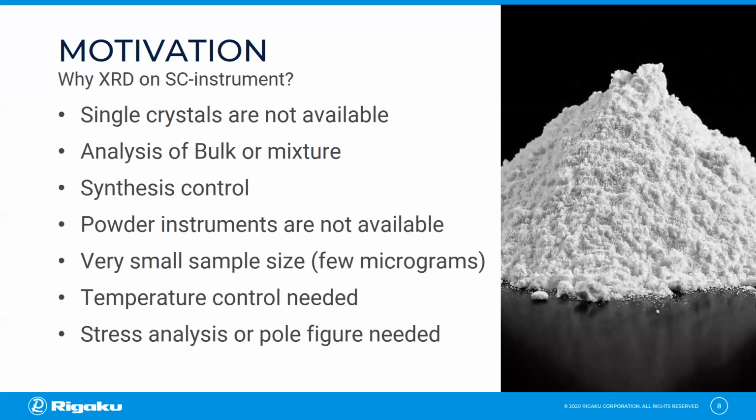Why and when should you use your single crystal diffractometer for powder diffraction? Sometimes single crystals are simply not available from your synthesis, or you already know the structure and want to control your synthesis outcome without performing a sometimes time-consuming crystallization. Under these circumstances, you want to perform a powder diffraction experiment. Powder diffraction is also a great tool for analyzing the composition of bulk samples or mixtures. You might also not have access to a powder diffractometer, or you only have micrograms of sample at hand.